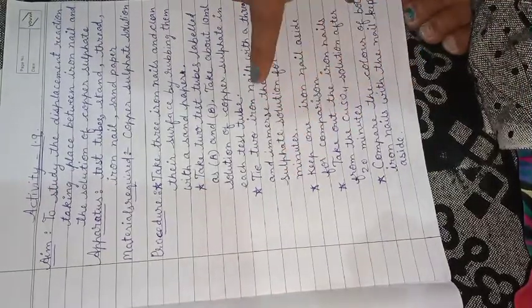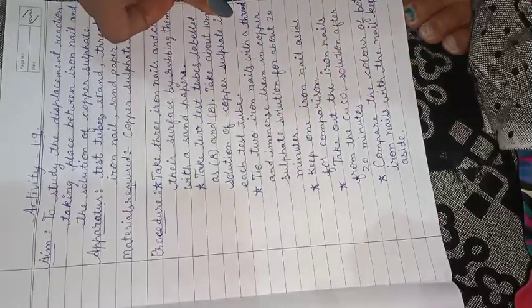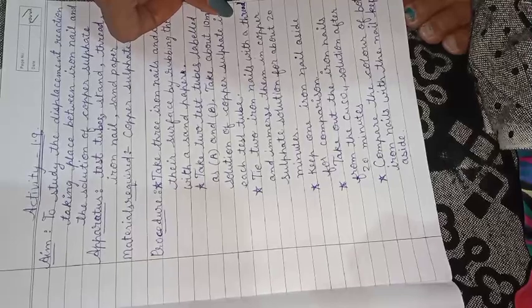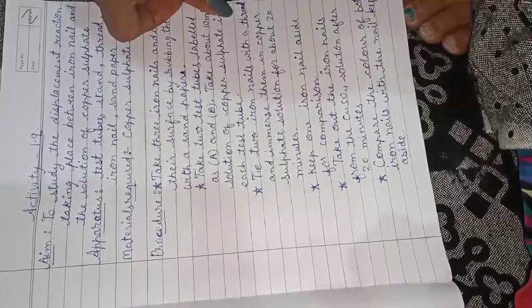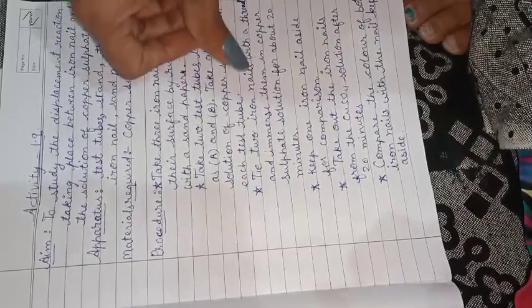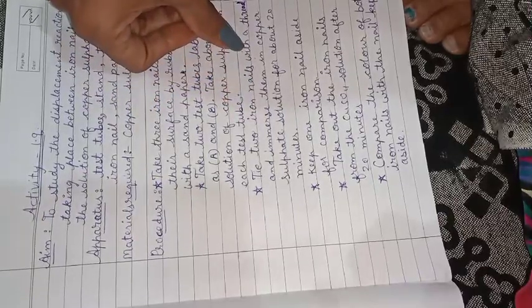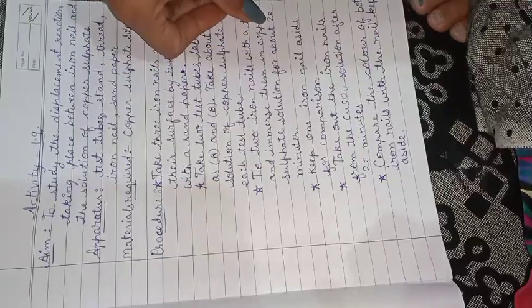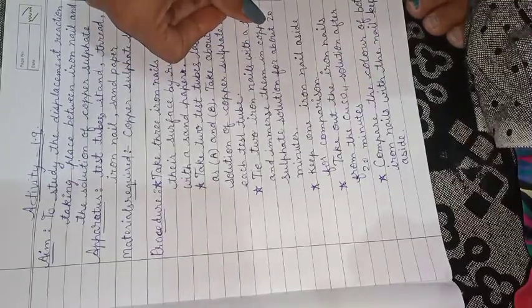Tie 2 iron nails with the thread. We will tie 2 iron nails with thread in one test tube in which copper sulfate solution is taken. In that test tube we will immerse the 2 iron nails with the help of thread in the solution for about 20 minutes. कितने टाइम के लिए लगाएंगे अपने बेटा? We will hang them for 20 minutes only.